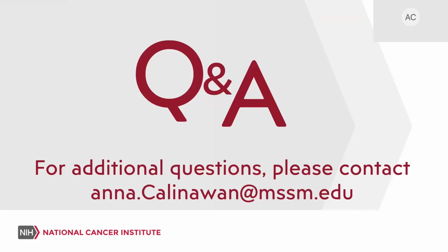So now we will address some of the questions in the chat box. Okay, great. So we have this first question from John. Can you apply customized hierarchical clustering dendrograms? No, you cannot, but that is a really great idea, and I'm going to add that as a feature to try to implement. Part of this is that it's also a way for me to get feedback as we're developing this for more cancers. So thank you. That's a really great idea.